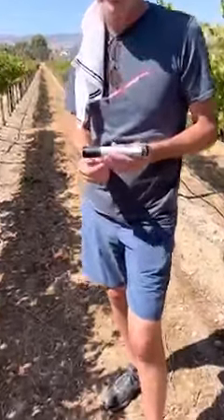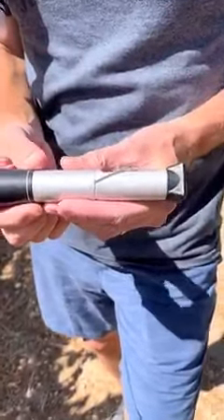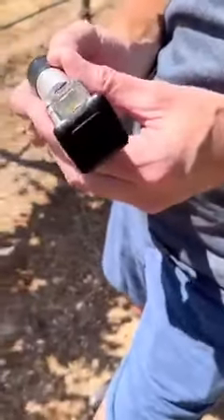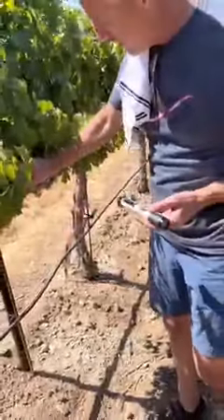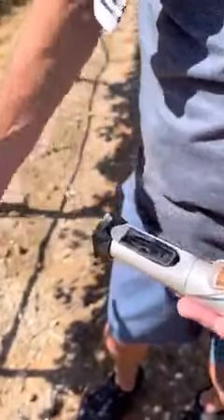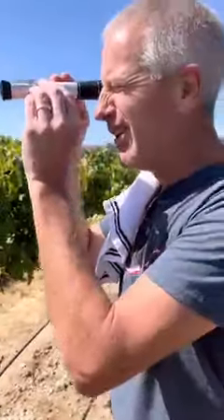What I have here is a handheld refractometer, essentially designed to do some really quick sugar level checks of fruit out in the vineyard. So what we'll do is go along, grab a berry off of a bunch, kind of squeeze that berry down, get some of the juice on there, close that down, and then look up.